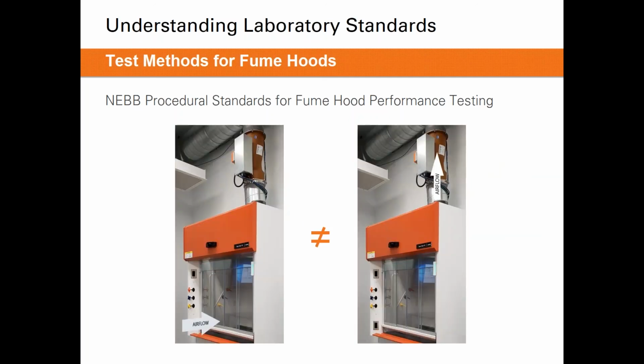So when we're balancing fume hoods and balancing the airflow valves for those fume hoods, we want to be careful not to equate the airflow that we calculate going through the sash opening to how much airflow is going through the valve. There should be a test procedure called out for the face velocity, and if required, there should also be a test procedure called out for performing the balancing of the fume hood exhaust valve.